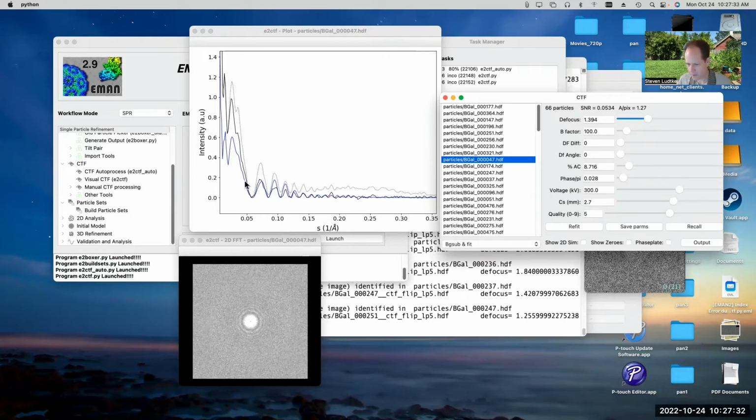The blue curve is the estimated fit curve, basically, which has also been multiplied by our structure factor estimate. Now you'll notice that there's a gap here, and that gap is basically because of the B factor adjustment. So if we adjust the B factor, we can get that to match pretty well, but then we'll find that the peak amplitude doesn't match very well at high resolution.